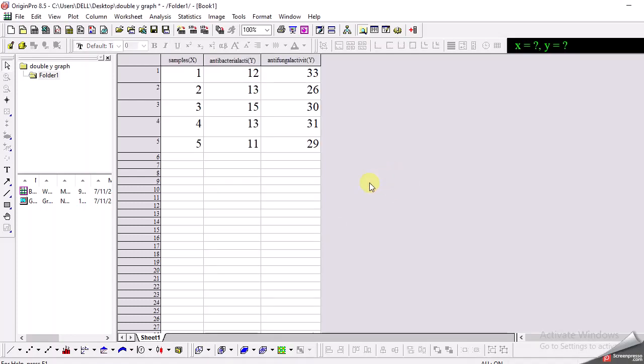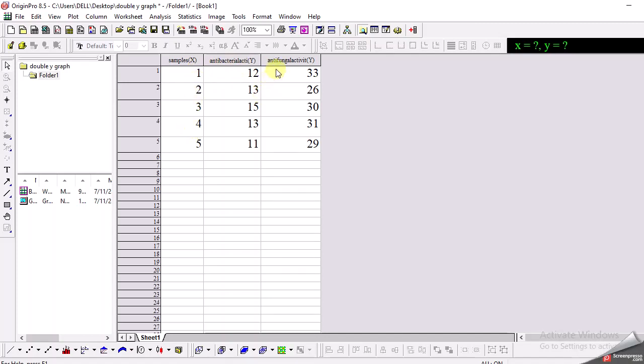So for this reason you have a set of data, and for example I have data for 5 samples 1, 2, 3, 4, 5 where I have written the sample numbers on this first column which will be the x-axis of the graph, and I have measured the antibacterial activities for these 5 samples and I also have the antifungal activities for these 5 samples.